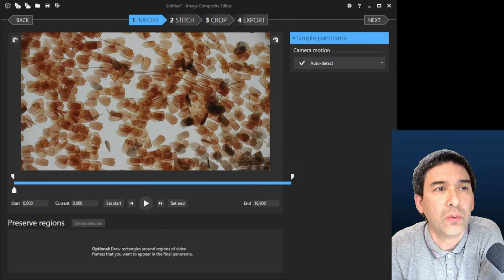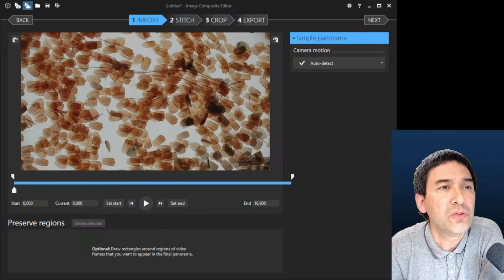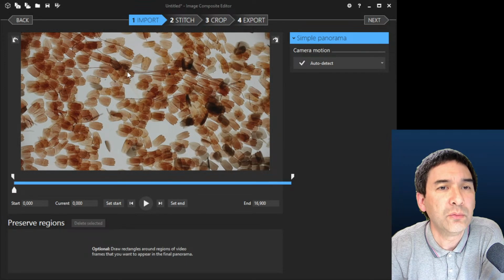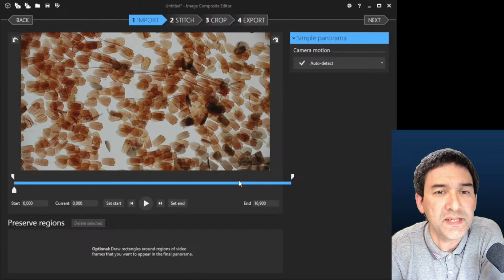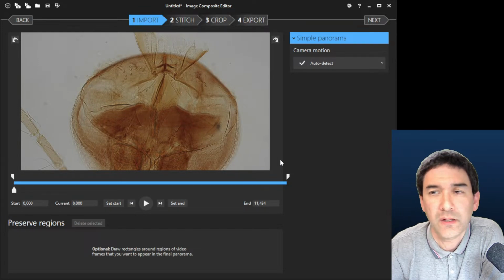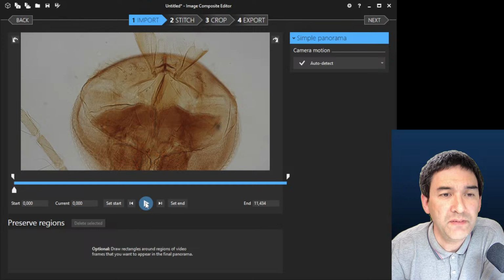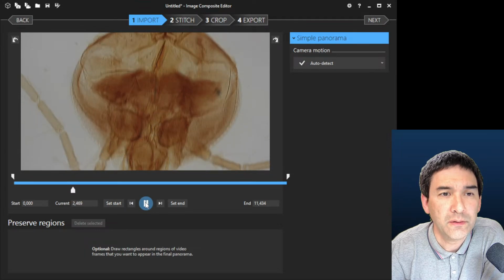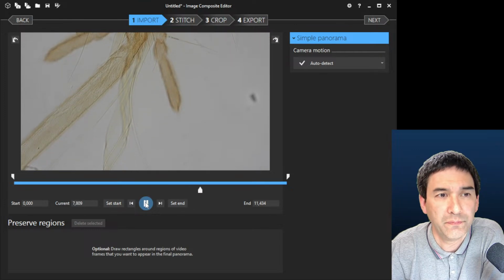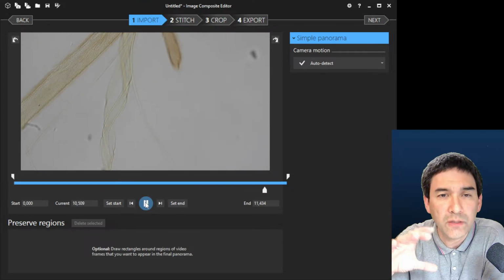Yes, here we go. What I'm going to do is start off here. I'm going to discard this. I'm going to start at the very beginning. I've made an 11-second video of this specimen, which I'm now opening up, and this is how it looks. When you play the video, look what I've done. I simply made a video of the slide. In this case, I only moved down.